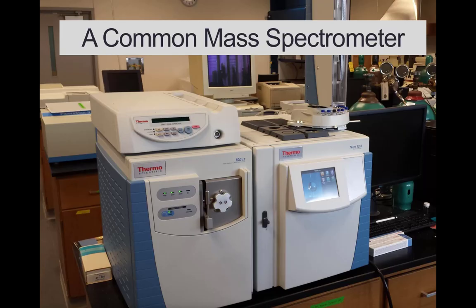So as we go forward, we look at a common mass spectrometer. This is one produced by a company called Thermo Scientific, but there are many out there. Basically, we'll see the cartoon schematic of this in a moment, but this particular instrument is equipped as well with an autosampler that would allow you to run multiple samples over the course of time, so you don't have to stand there and inject each one separately. But all of the functional parts of what we're going to talk about are inside these boxes.